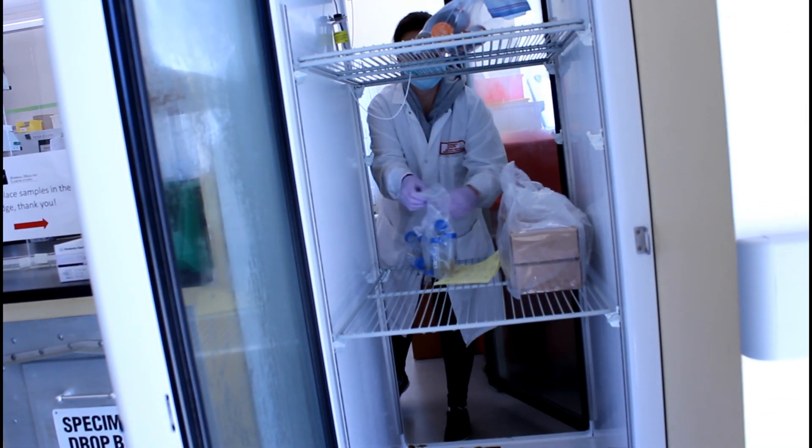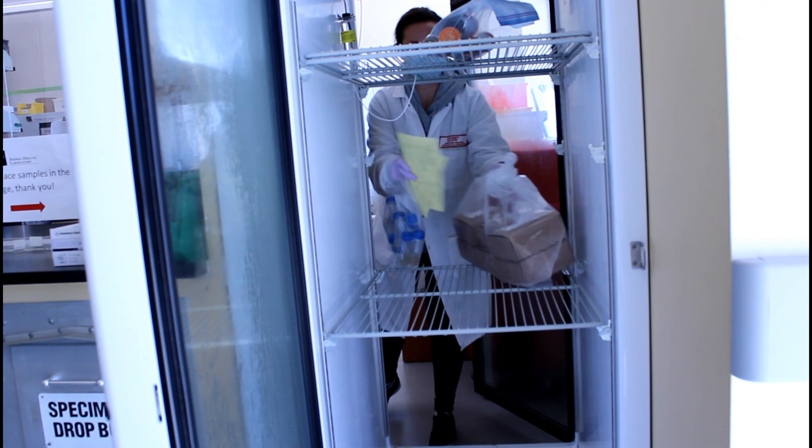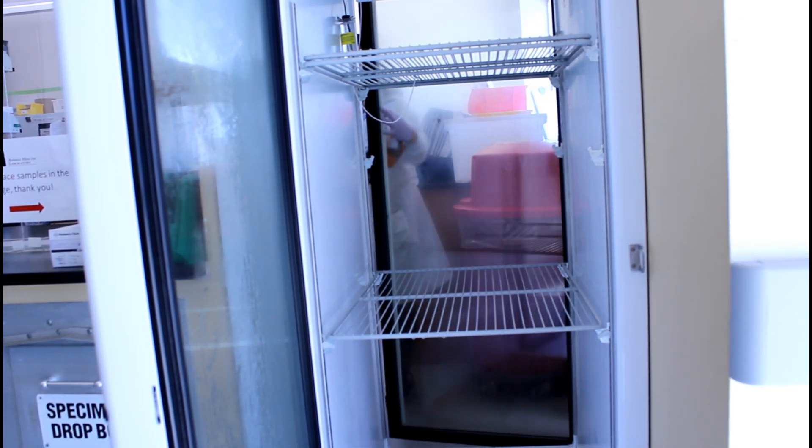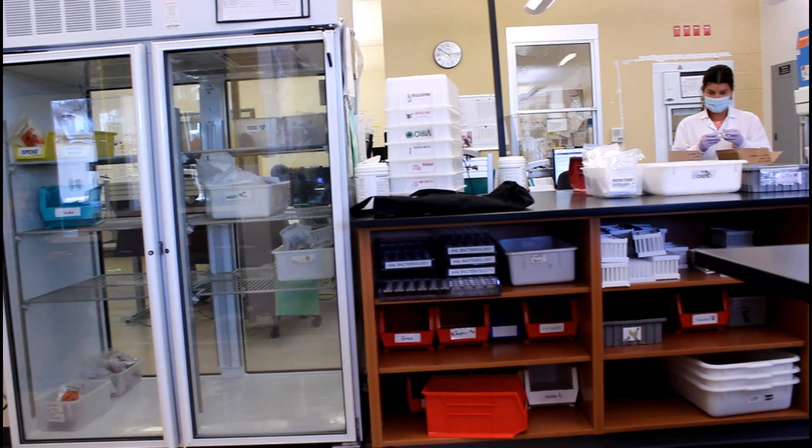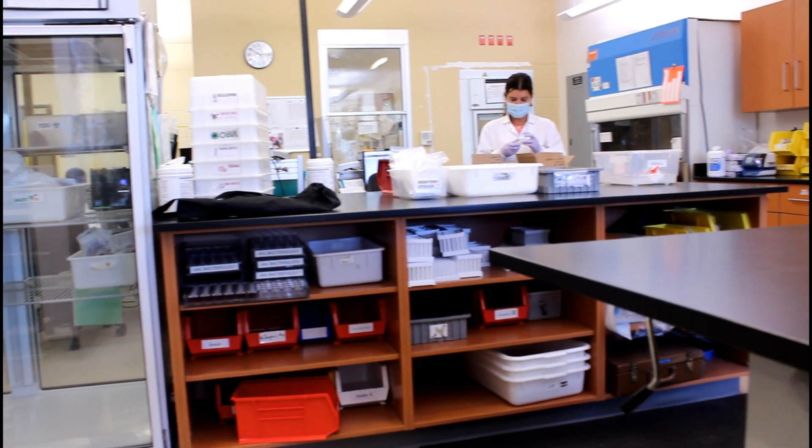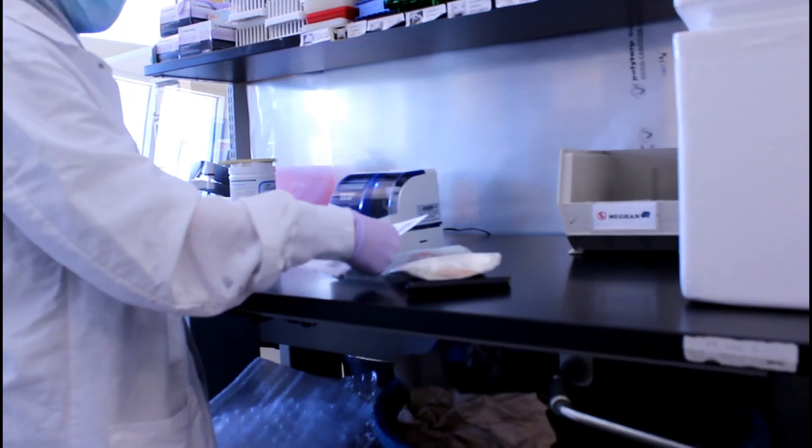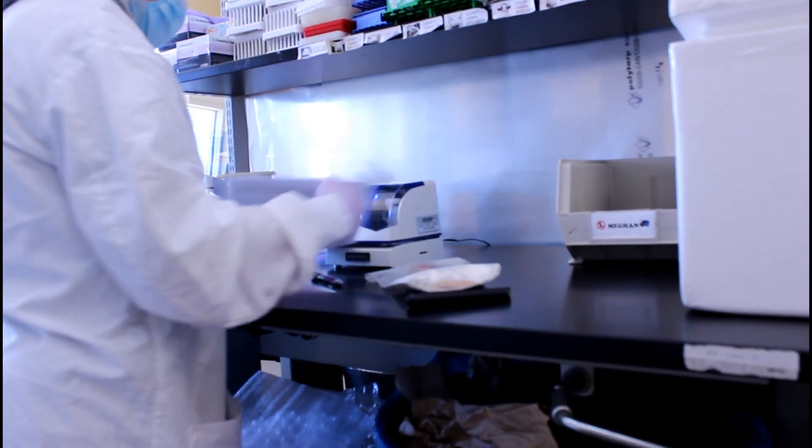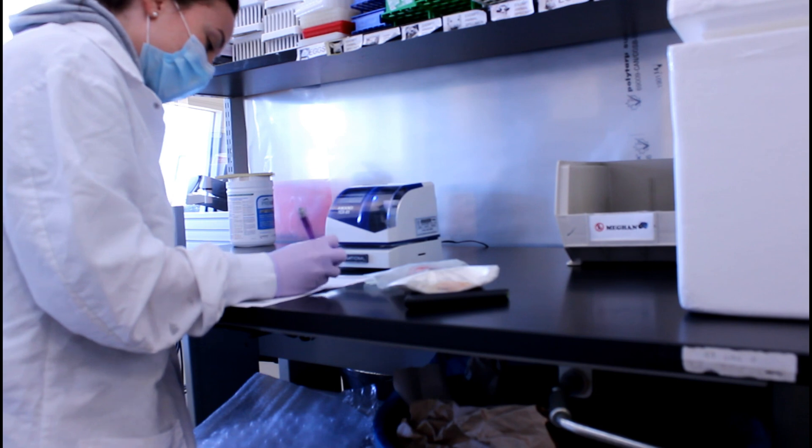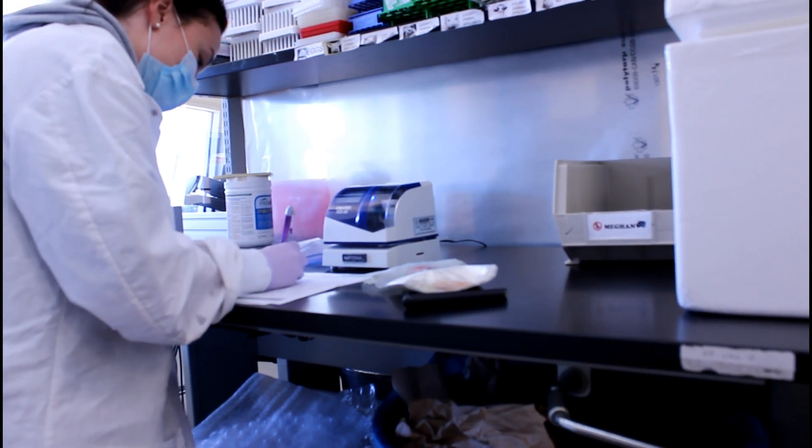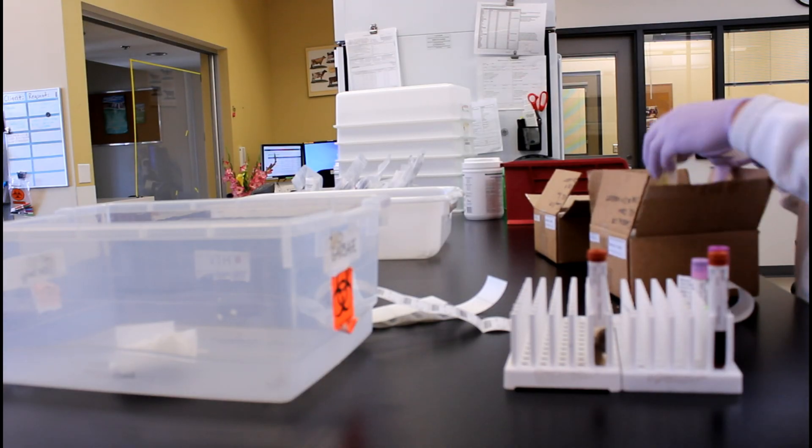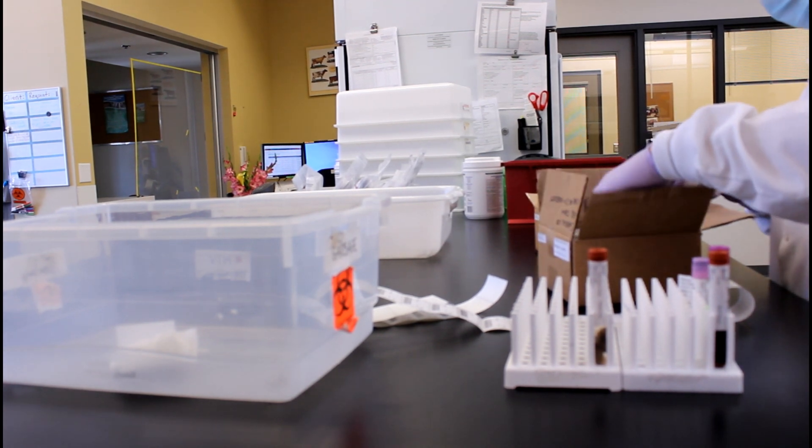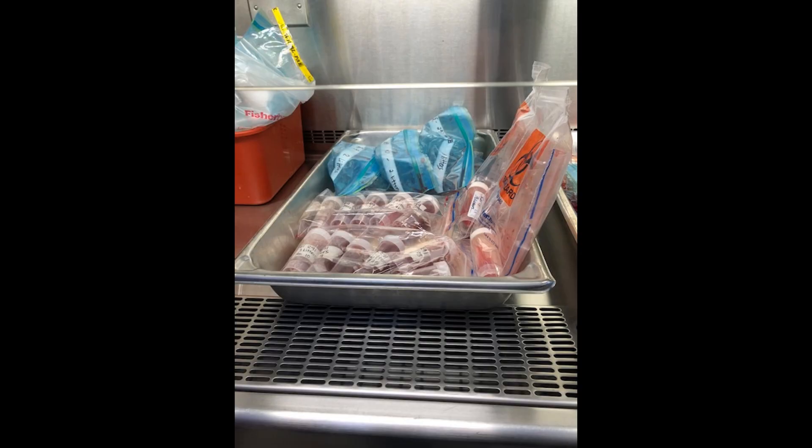When samples leave the clinic they look like they're in pristine shape. However, they don't always arrive that way. At our lab, samples arrive as you can see and they're unpacked by our team in specimen reception. Our staff enter the information into our computer system and send it up to the lab as soon as possible. The biggest slowdowns in getting your samples from the clinic to the lab bench come from samples arriving broken or leaking and with submission forms missing, not filled out, or illegible.